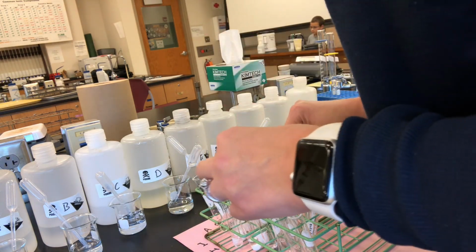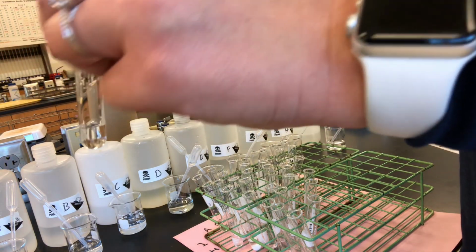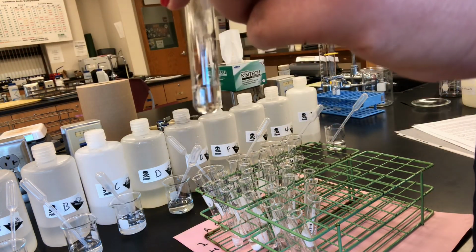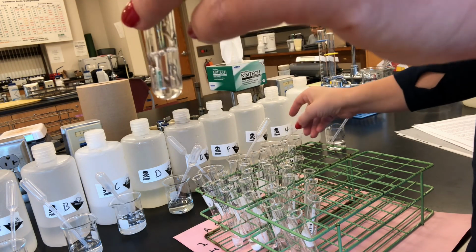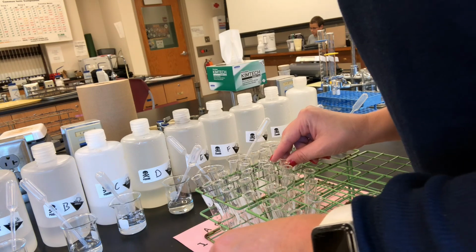All right, so now we're going to do E, and I'm going to add some G. E and G: no change. E and G results in no change.